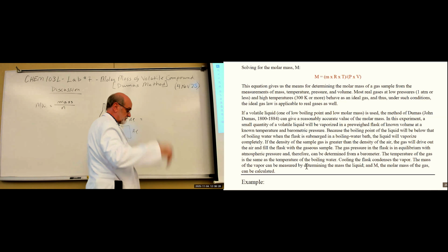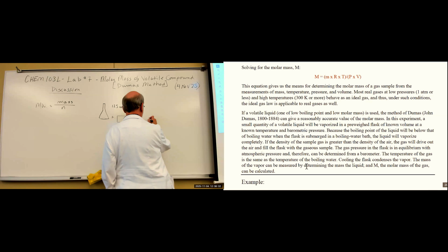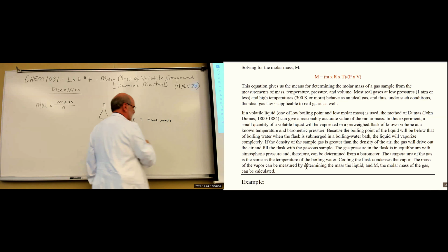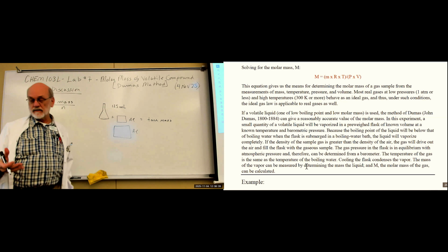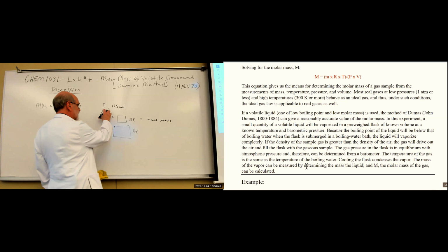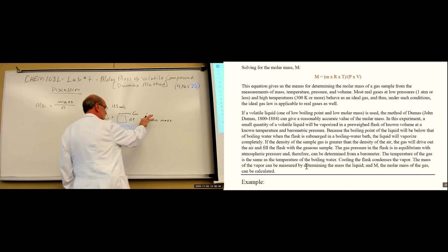My mind just went blank. The tare. The tare mass. What that means is the container weight, the mass of the container. That's these two, plus the copper wire. Those three give you the tare mass.